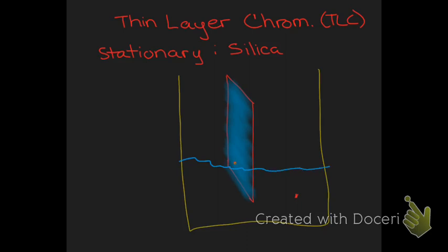Now that solvent is going to do what any liquid does when it sees a thin film of something. It's going to rise up the film. So your solvent is going to go upward just like it would on a piece of paper. If you dip it into a liquid, that liquid tends to seep up the piece of paper. Well, what that is hopefully going to do for you is make it so that as your liquid rises up, you end up with a separation of your red versus your green. So that is the introduction that I'm going to give you to thin layer chromatography.